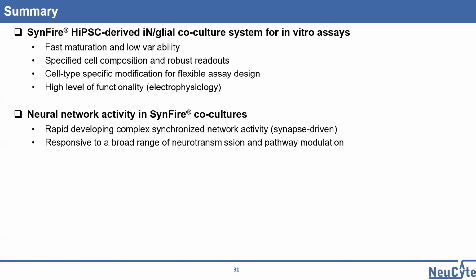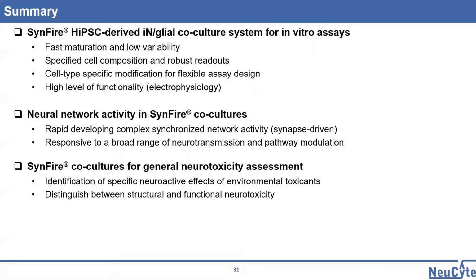And this network activity, based on all the data that we have, is synapse driven. So synaptic tests can be conducted on these models, and they are responsive to a broad range of pharmacological modulation. These can be used to identify neuroactive effects of environmental toxicants, new toxicants, but of course only in those domains where we know functional pathways are integrated.